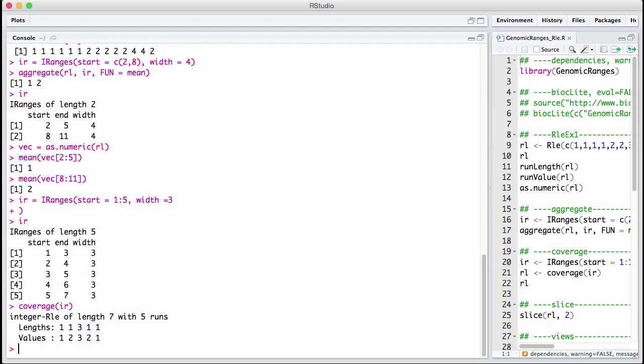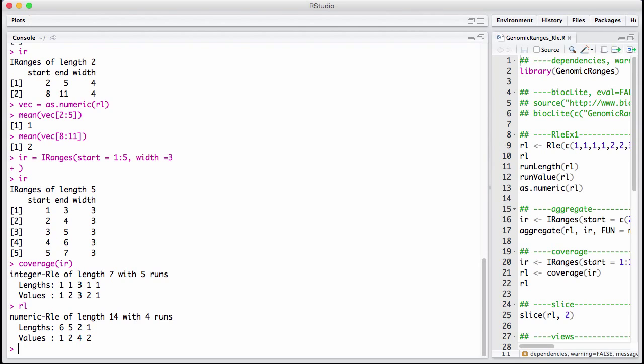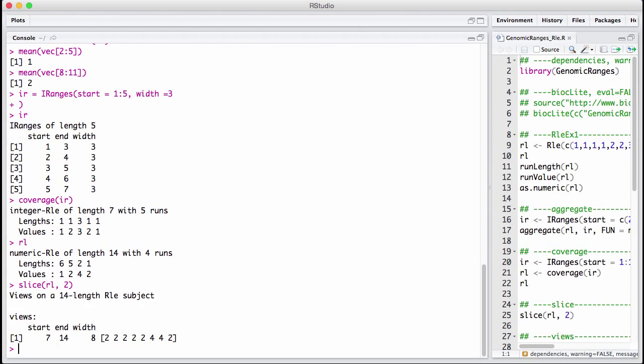Sometimes you have a coverage vector. So you have an RLE, and you really want to figure out areas where this vector are big. And I want to get that back as intervals. The way you do that is you use the slice function. So you can think of the coverage function as giving you kind of a function along the genome, and now we slice the top off. So let's take our RLE from before, and let's slice it at a value of 2.